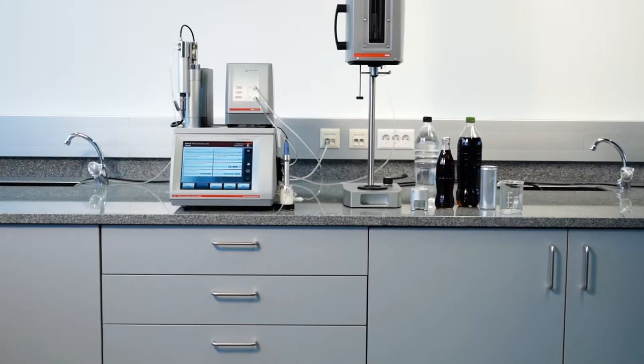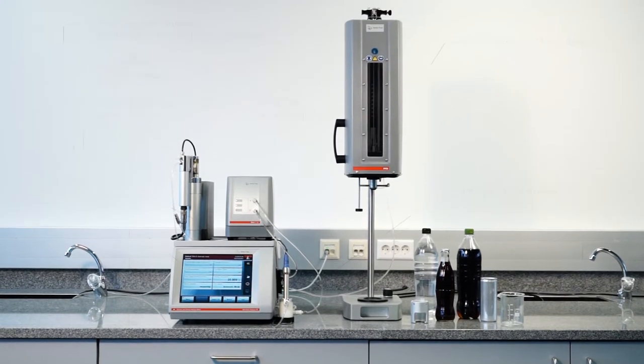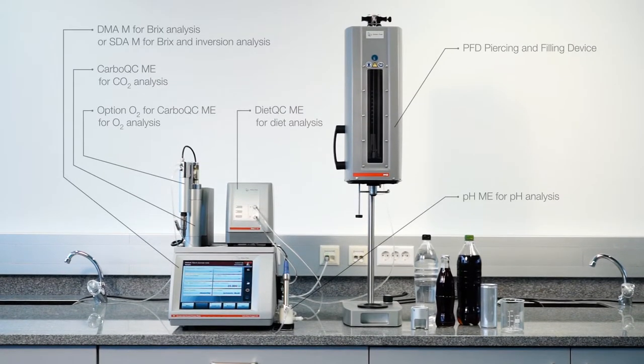The main measuring parameters are obtained simultaneously without prior sample preparation. While PBASD is commonly in use for the analysis of diet soft drinks, sugared soft drinks, and sparkling water, PBASID is able to provide additional information about the sugar inversion process of the sample.